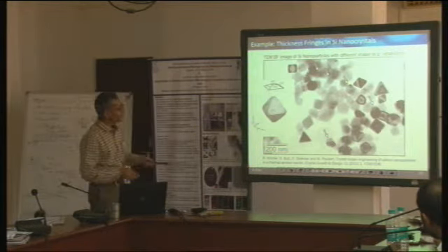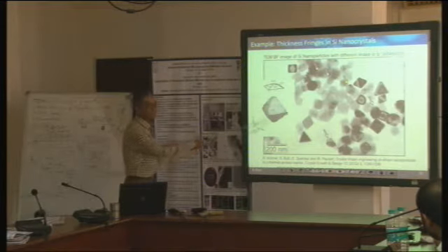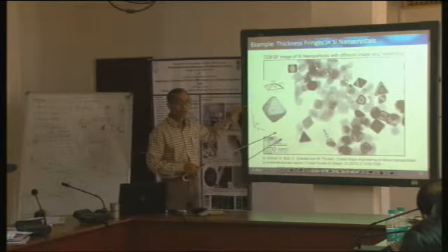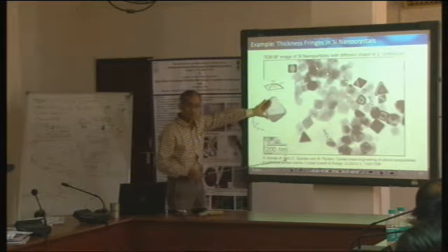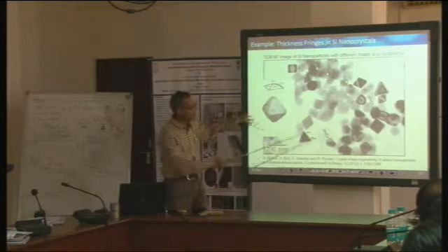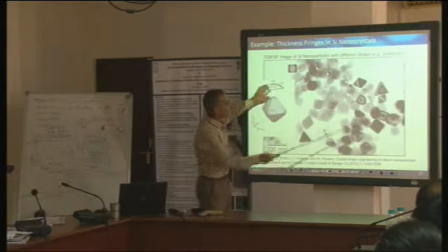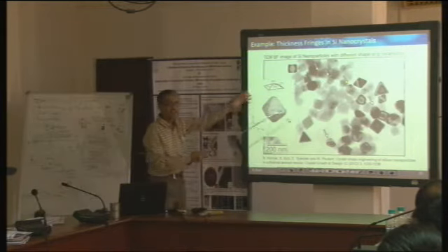So now these are nanoparticles, and they are of this kind of shape. As you can see, this is prone to giving thickness fringes, because it is like a wedge-shaped sample. This is a nanoparticle, but still it is wedge-shaped. For example, this one, looking from the top, may give thickness fringes like this, and so on. There might be many other examples if you search and identify.